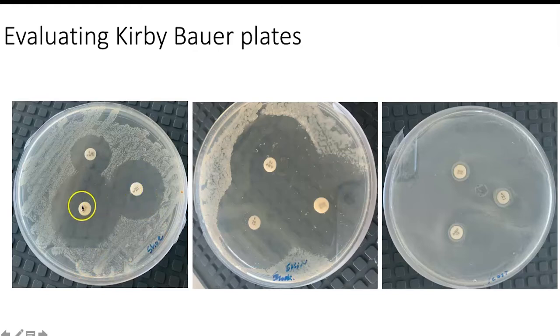And then these are the three different antibiotic discs that were placed on it prior to allowing the bacteria to grow. What you can see is that the bacteria is growing over the entire surface of the plate, but near each of the discs, there is this region where there is no bacteria growing. We call it a zone of inhibition. If you look at this circle that I'm drawing here, you could measure the diameter of this circle and compare it to the other antibiotic discs.